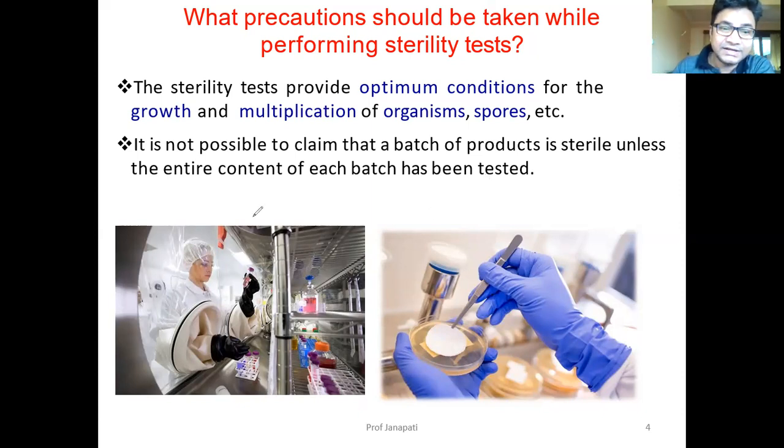So this is the diagram which we are telling about laminar cabinet or room. This is about filtration techniques. This diagram explains the filtration technique which is used during sterility process. We will learn in coming slides. So this is the introductory part of sterility test. Sterility test is done for all the preparations which are claimed to be sterile. So this is the one thing.